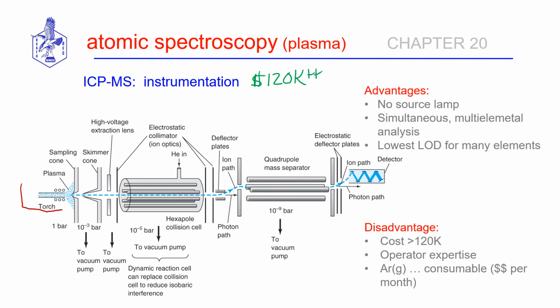Your torch and the plasma is here. Okay. Years of research, they had to learn how to get the emitted species to be transferred into the interface.